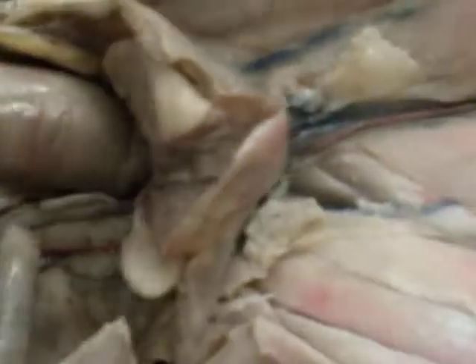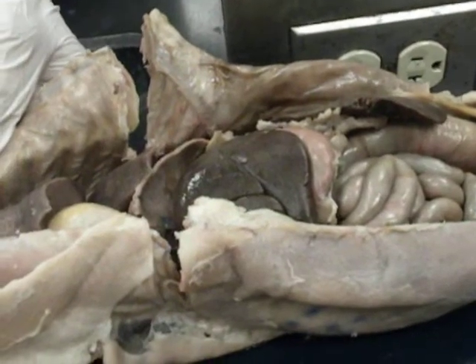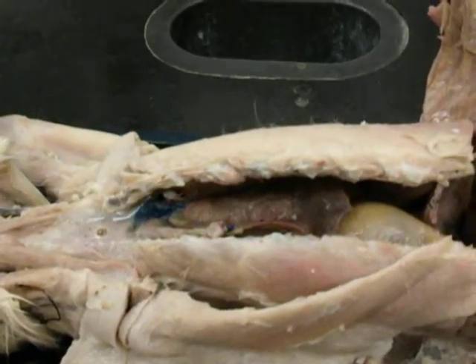And then also next time I'm going to ask you to take out a kidney, which is back here. This one, I don't want this one out. I want this one out. So take that one out. We'll cut it open. And then we'll also go ahead and cut all this thymus gland off, so it makes Tuesday with arteries much easier. You don't have to spend so much time cleaning on Tuesday.